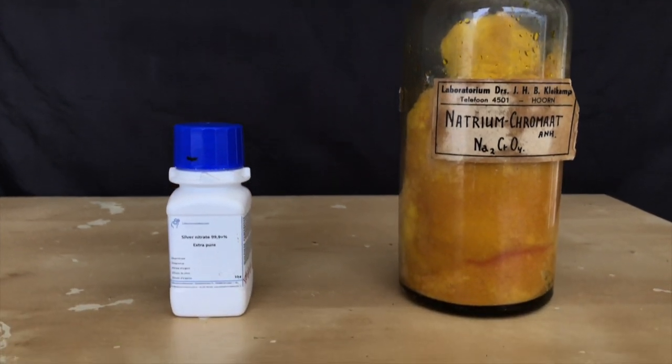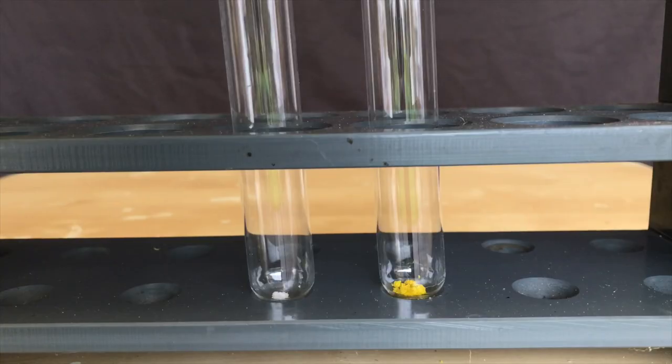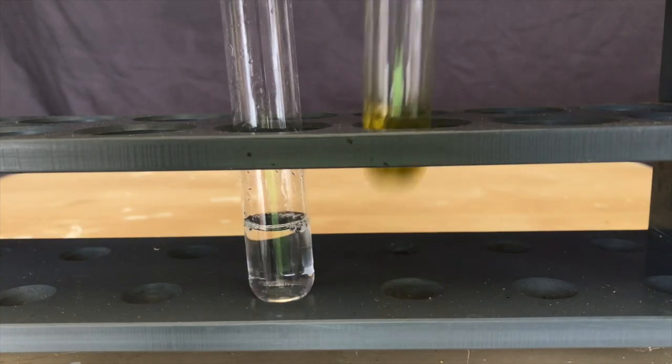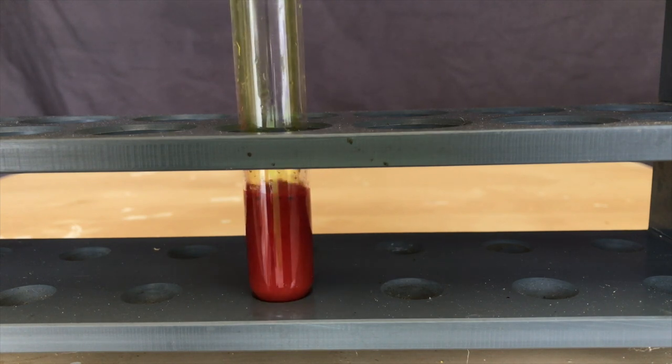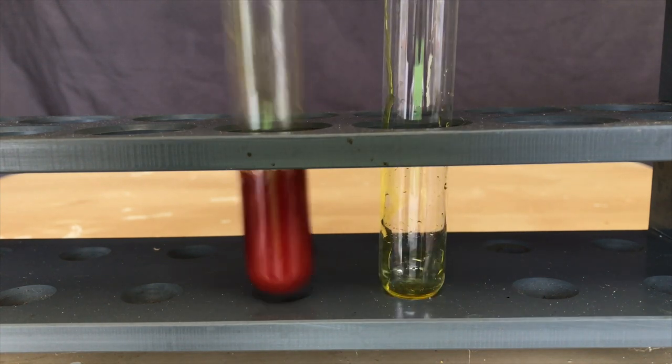For the next experiment, we are therefore going to need some sort of silver salt and sodium chromate. The silver nitrate on the left and the sodium chromate on the right were dissolved in a small amount of distilled water and then they were combined. Red precipitate immediately started to settle out. This is silver chromate.